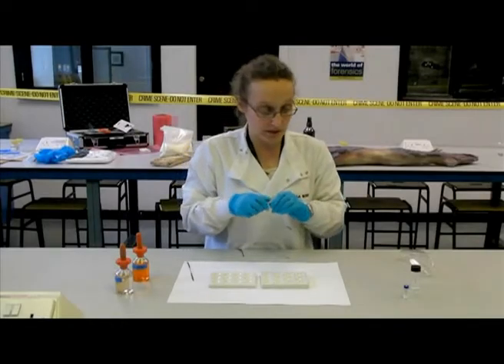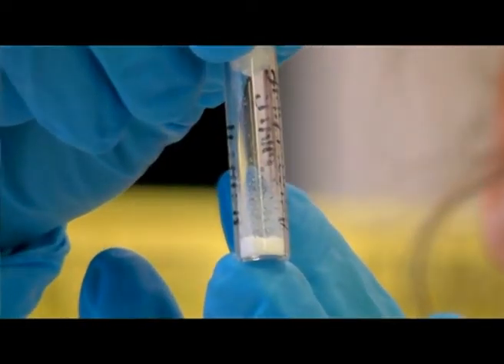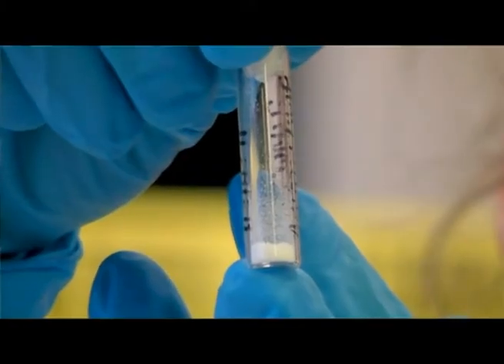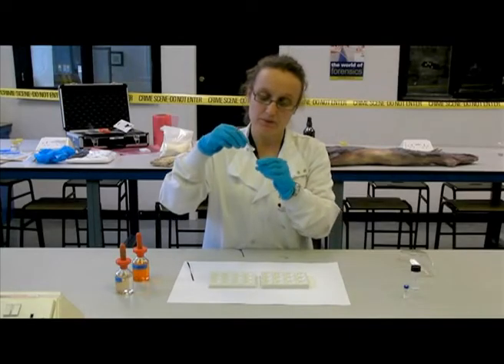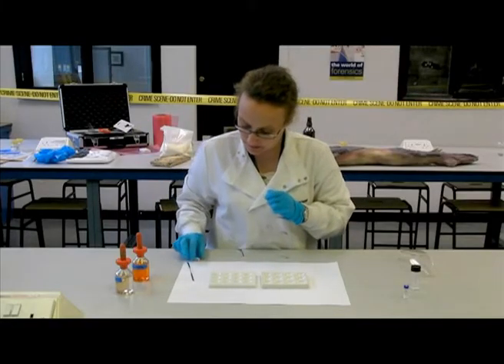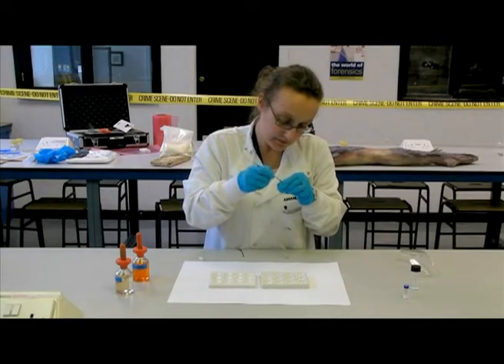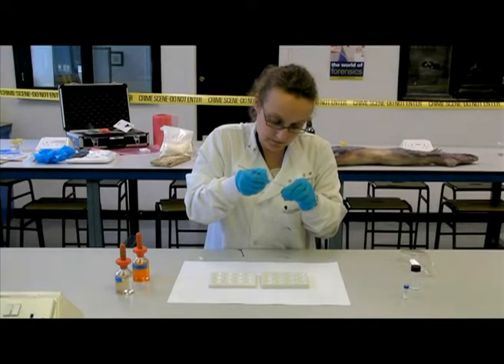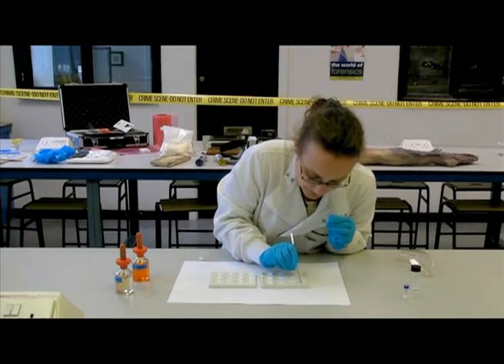The first drug I'm going to look at today will be amphetamine. It's part of a street sample of amphetamine. So what we need to do is obtain a very small sample from this little vial using our spatula. We place that into the blank well of a spot plate.